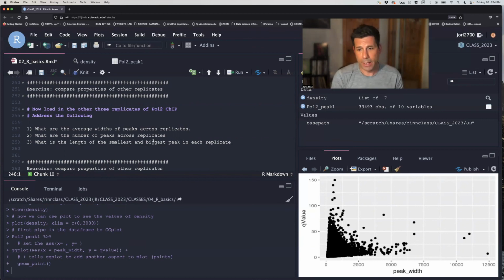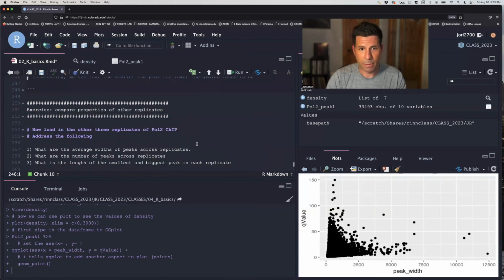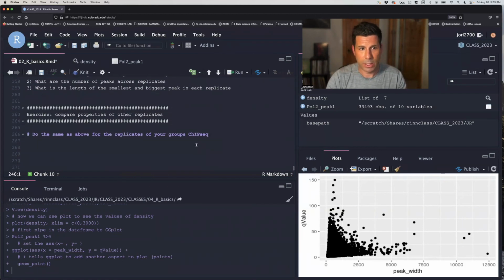Okay, and then we're going to take it some more steps, do some find overlaps, and keep pushing along on the analysis, using and learning R at the same time. So the goal is to learn R and apply it to things with our data that we just generated, and get deeper and deeper into the genome binding of DNA binding proteins.